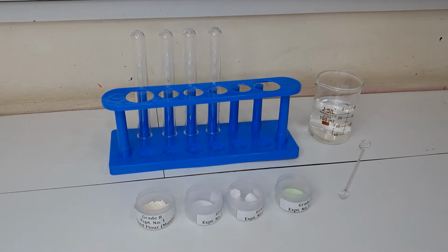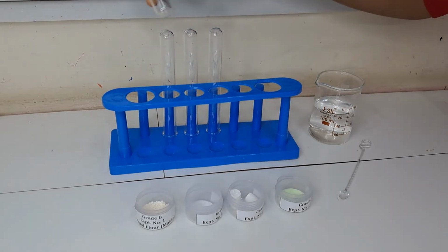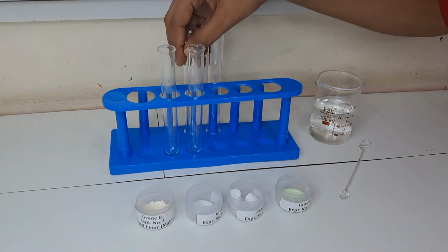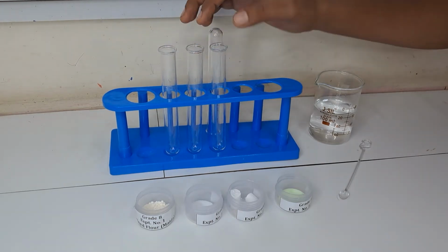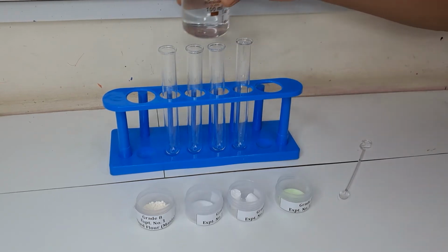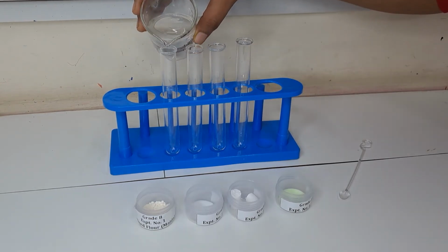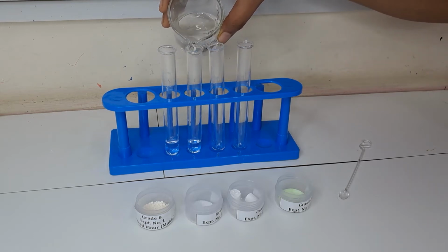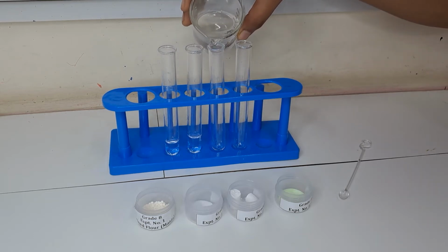Let's start the experiment. First, you have to take approximately 2 ml water in all 4 test tubes. The amount of the water should be the same. So first, you have to stand the test tubes as we have mentioned here, and add approximately 2 ml water in all 4 test tubes.